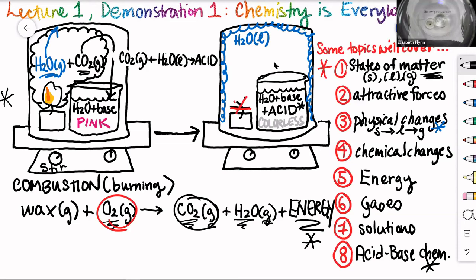Okay, so this happens to be a pretty deceptively simple situation that we have going on here. There's a lot going on, a lot to think about in such a simple demonstration. And it turns out that this whole system that we have going on is actually a model for a real world problem. This is a real world reaction occurring right now in the bodies of water and especially the oceans on this planet, called ocean acidification.